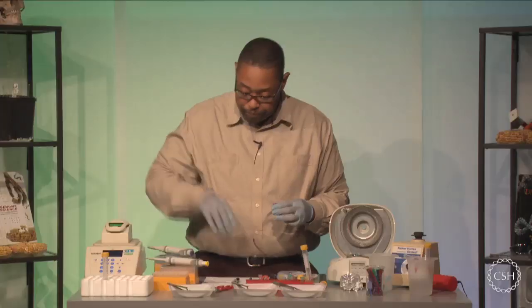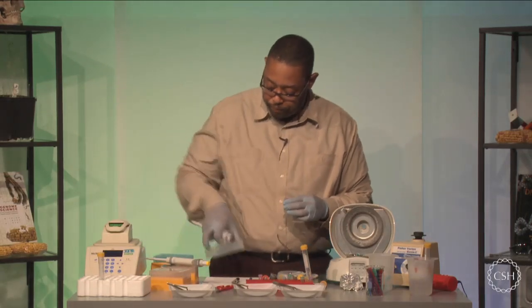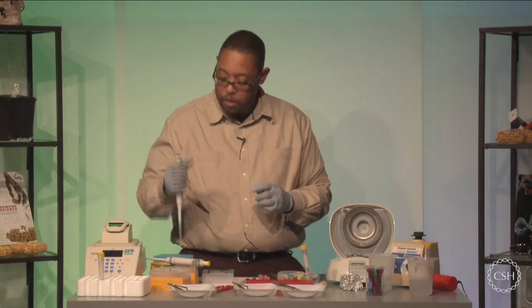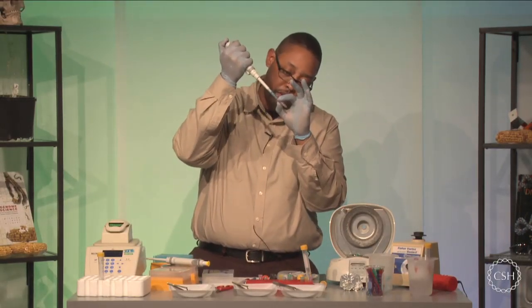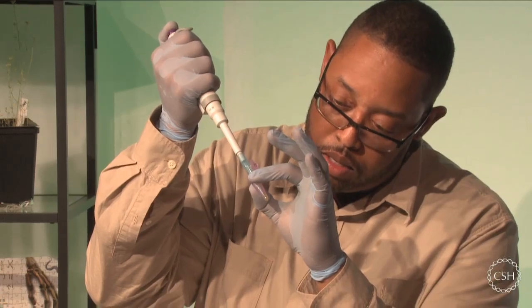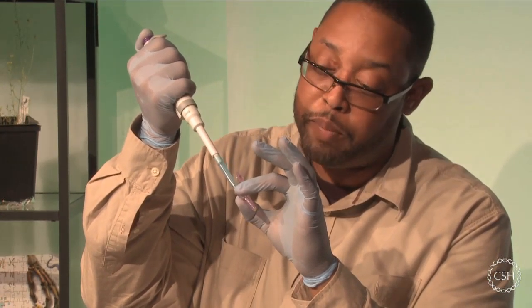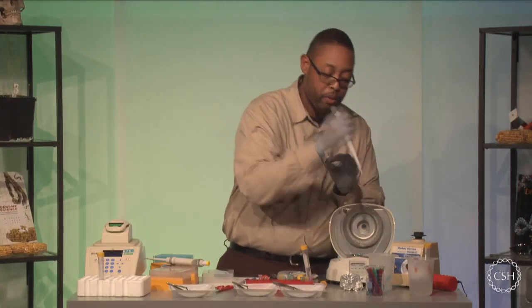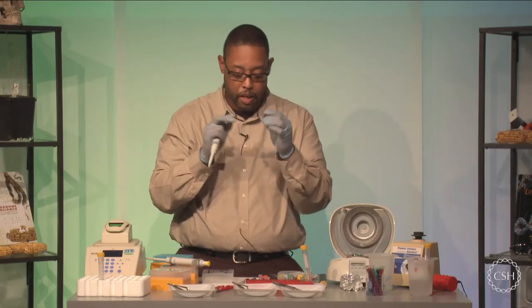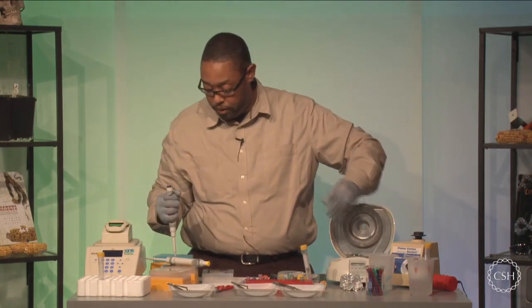So what I'm going to do is switch over to using my P1000 one more time. I'm going to draw the full 150 microliters of the supernatant out of there. I want to try and get as much out of there without disturbing the pellet, so do not touch the pellet at all. Remove as much of that liquid as possible and expel that into a garbage bin. And then I'll place this here, and we'll do the same for the other 2 test tubes that we're physically working with.